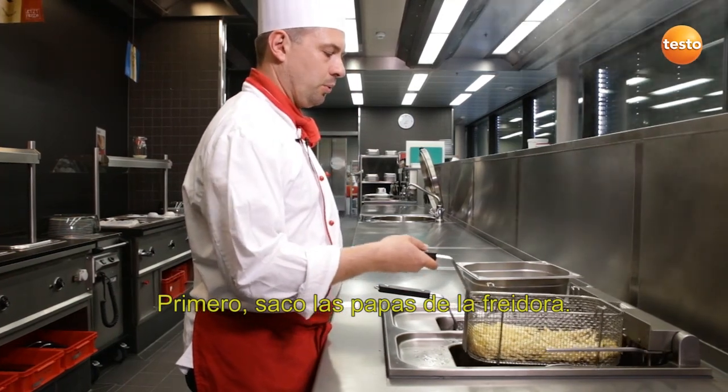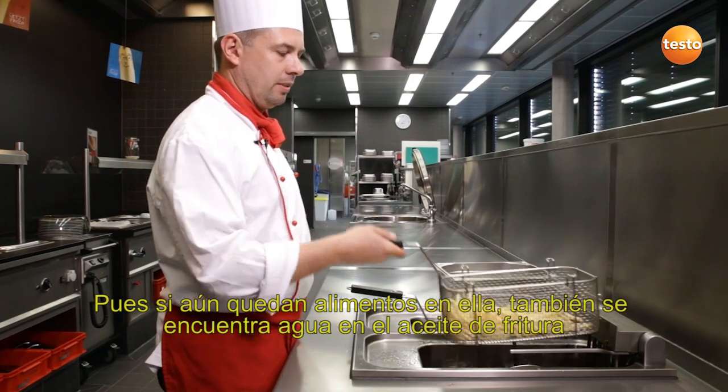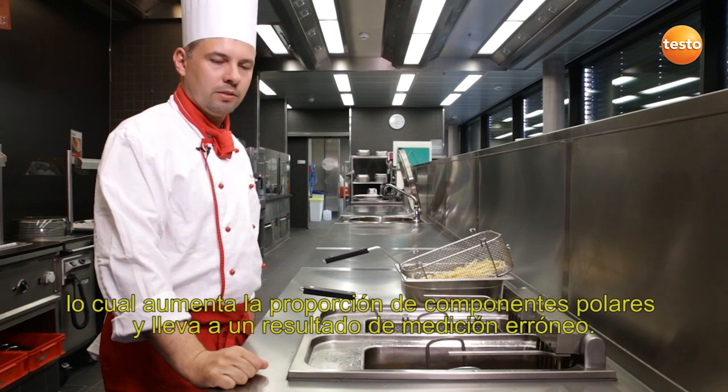First of all, I take the fries out of the deep fryer. Because if there's any food left in it, there's water in the cooking oil too, which increases the polar component and would lead to false measurement results.